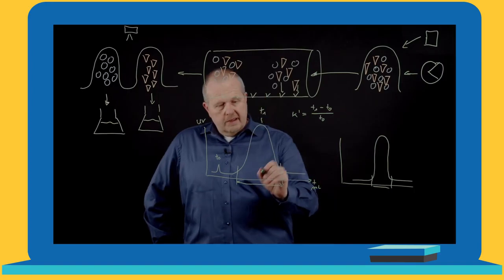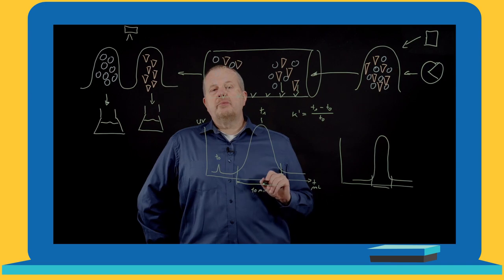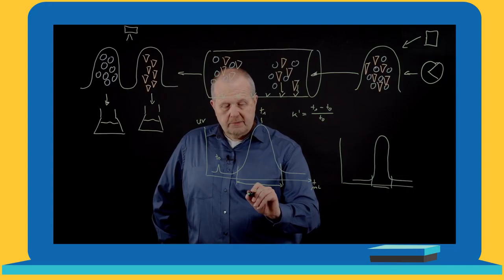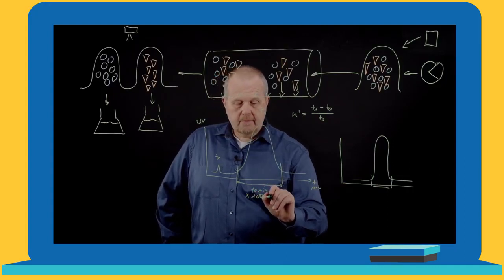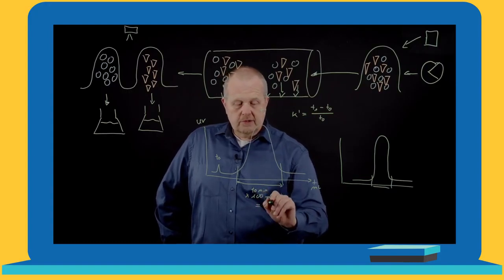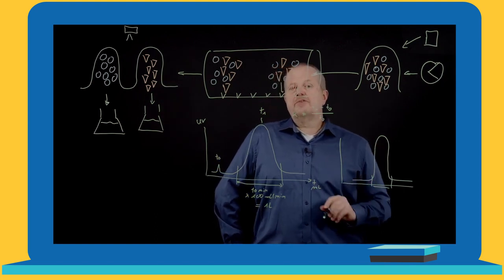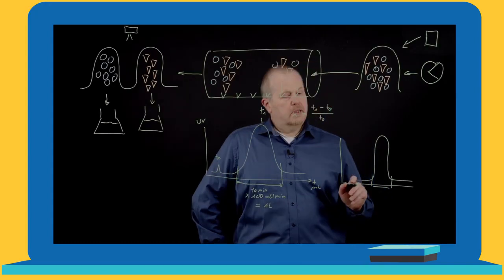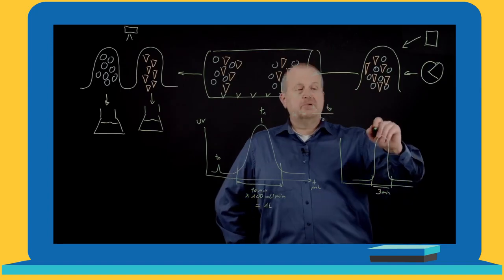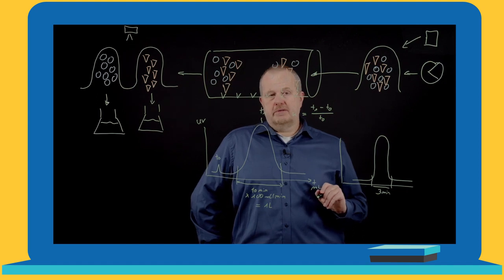Now we say, okay, this is a time span of 10 minutes. Our chromatographic system is delivering the buffer solution with a flow rate of 100 milliliters per minute. So in the first case, this gives a total volume of 1 liter of fraction, which we have to process further. On the other side, this chromatogram with a much narrower peak, which is higher and more concentrated, has a collection time of only 3 minutes.